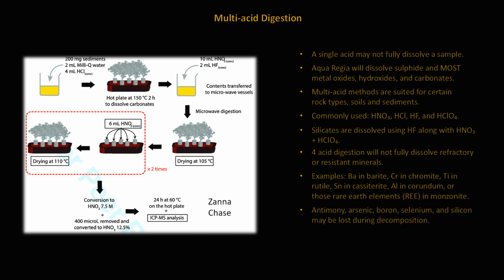Antimony, arsenic, boron, and selenium, and as mentioned, silicon may be lost during decomposition, especially when the sample solution is evaporated to dryness. Hydrofluoric acid will form fluorides. Fluorides are not soluble in other acids such as hydrochloric acid. Using nitric acid will help solubilize the fluorides for removal.